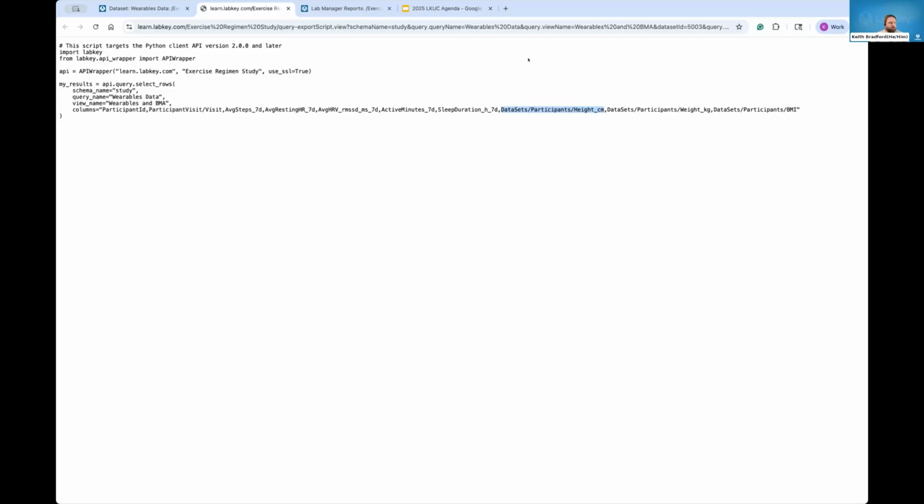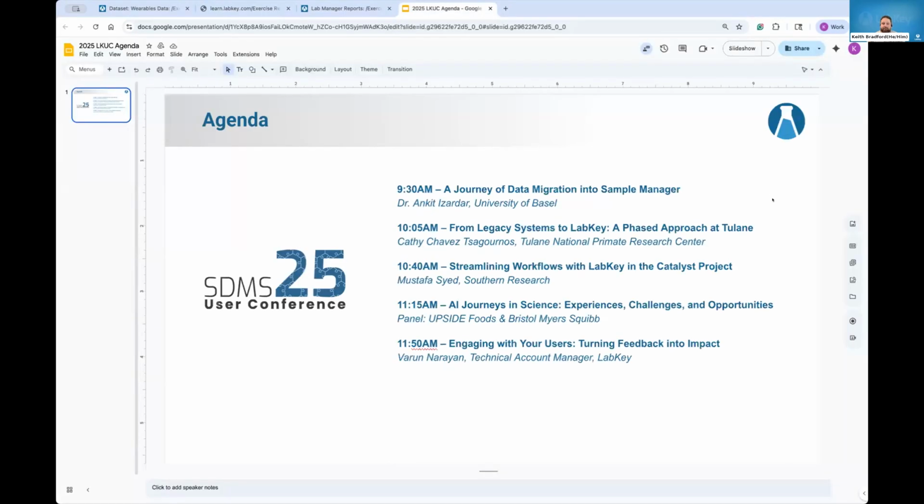Hopefully you can see different ways that you can report out to different clients. This is just scratching the surface. And so there's many different ways that you can do reports. As we've said over and over again, please talk to your account manager. We're happy to help with giving additional insight and helping set up reports.